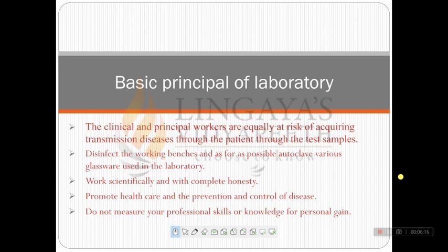Why? Because everyone is involved in the laboratory operation from the highest administrative level to the individual level, and it must be safety minded. So safety awareness can become part of everyone's habit only if the safety is discussed repeatedly, and only if the senior and responsible staff demonstrate a sincere and continuing interest in the safety.